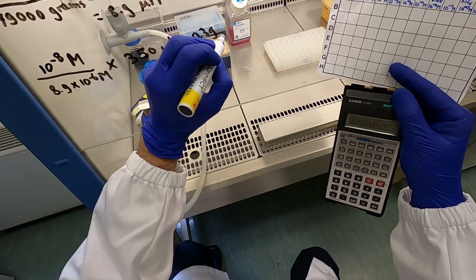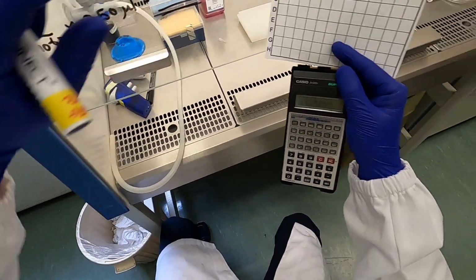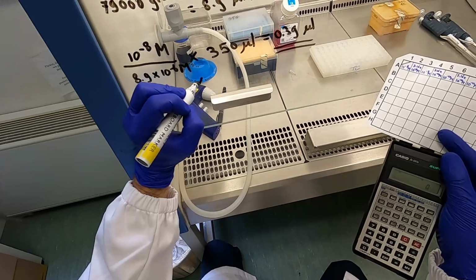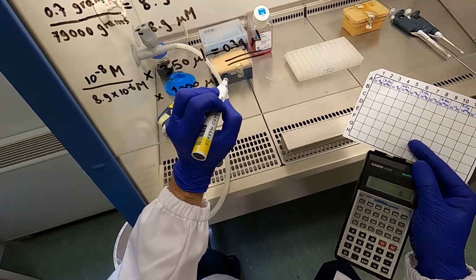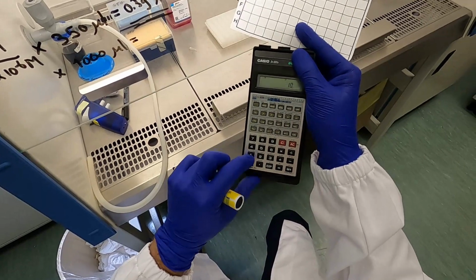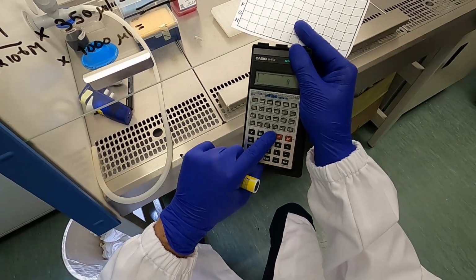I'm actually not so comfortable pipetting that accurately, so it's much nicer to pipette a slightly bigger volume. In fact, with these things, if you want to be very accurate, you want an even bigger volume than we're going to use, which is a volume that we pipette into 1 ml, 1000 microliters, which we figured out was the 1.12 microliters.